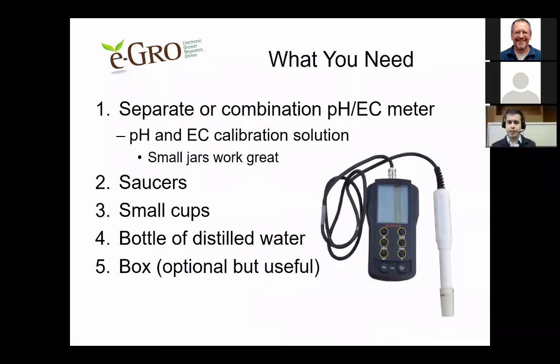The things that you'll need to put together your own pour-through kit: first and most importantly, you need a pH and EC meter. You can see on the screen a combination pH-EC meter, but they also come separately. Either way, you will also need pH and EC calibration solutions to calibrate your meter whenever you use it. Since calibration solutions often come in larger bottles, it's useful to have a small jar or vial to carry a small amount with you.